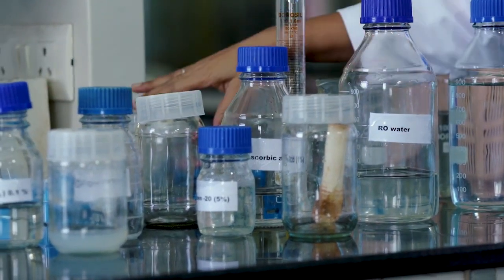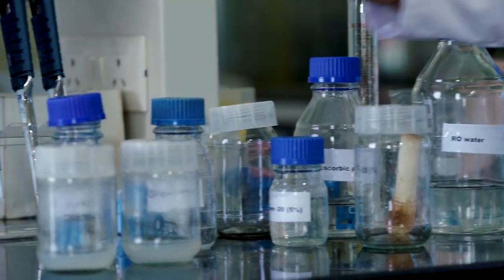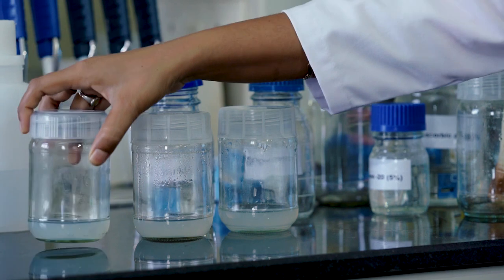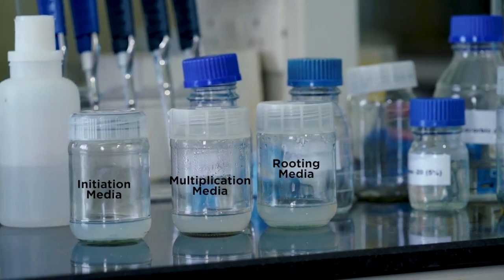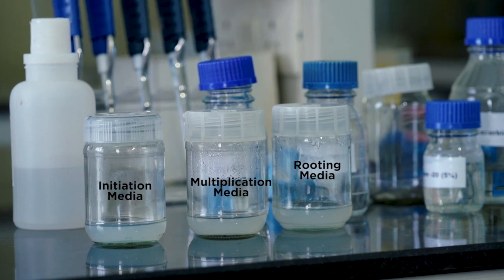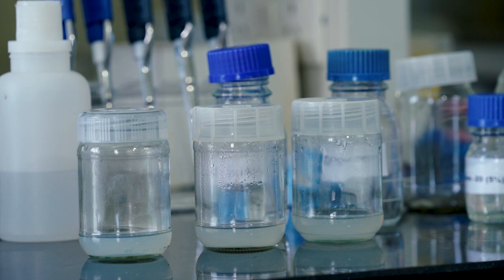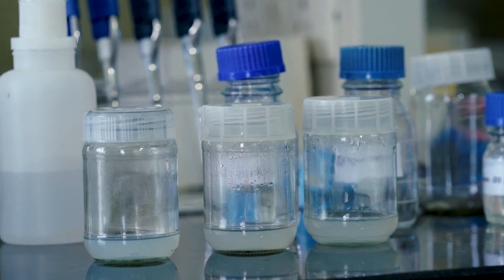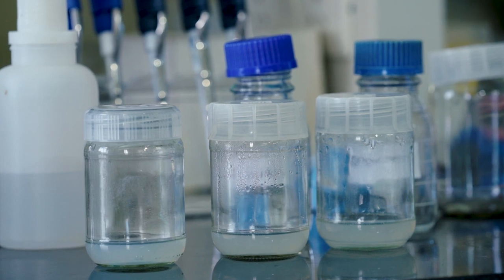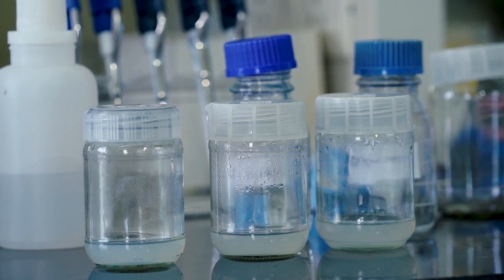For micropropagation, 3 types of nutrient media are required. One is initiation media, second is multiplication media, and third is rooting media. These nutrient media are prepared using organic as well as inorganic salts. We prepare the nutrient media by dissolving inorganic as well as organic nutrients.